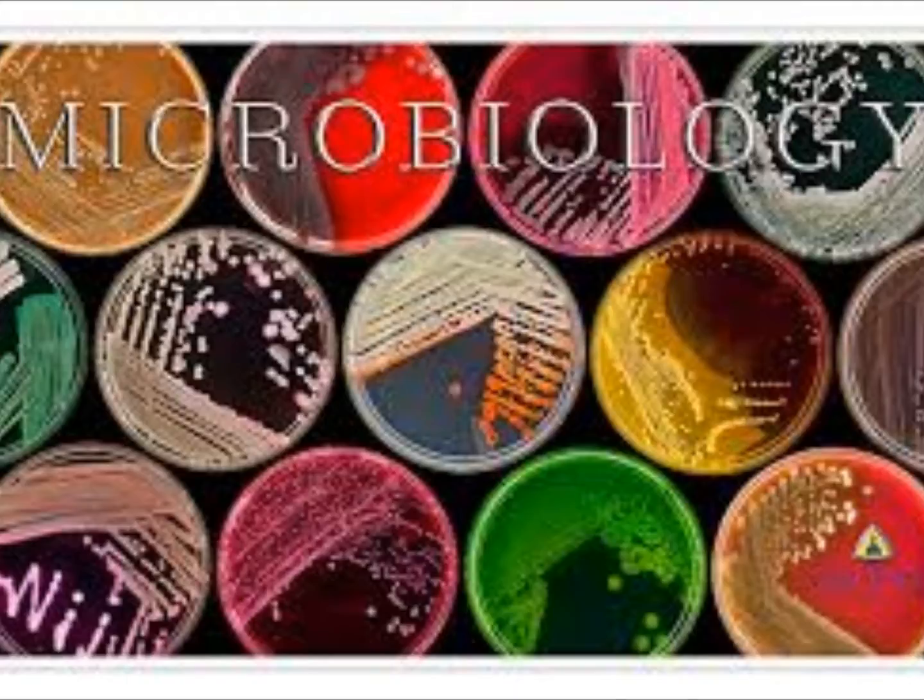Hey Jean, I got a question. Would you see clearing on here? 'Cause I don't. Did you put it up to the light and look around the colonies? What's your organism? Staph aureus. I should see some. I do, I can see it on here. I saw it around the big section, where it's clear.